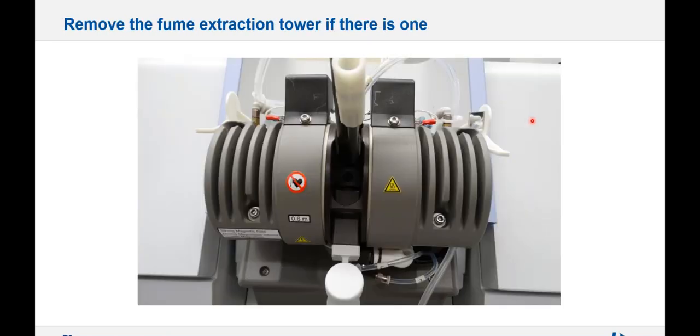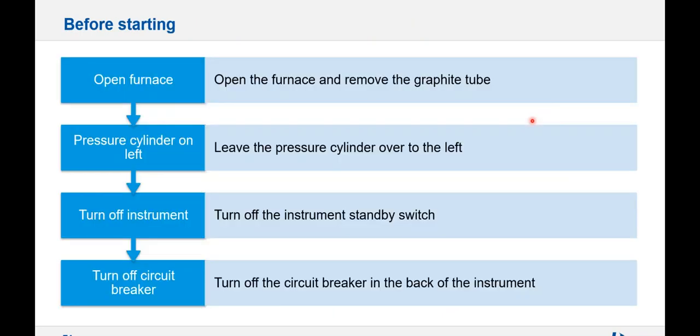If you have a fume extraction tower, and that would be on an older model, you want to remove the fume extraction tower first before you change your contact cylinders. And before you start, you're going to open up the furnace and remove the graphite tube. You want to leave the pressure cylinder over to the left so you can access the contact cylinders.